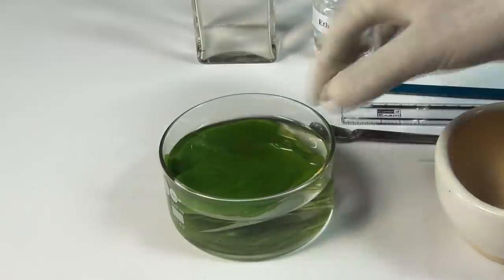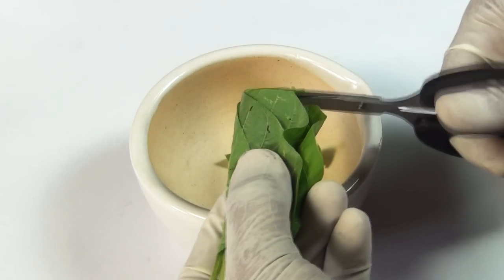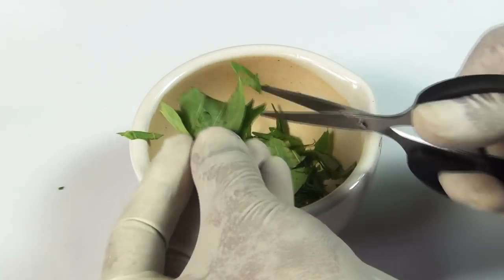Procedure: Take a few freshly plucked green spinach leaves. Using scissors, cut the spinach leaves into small pieces and let them fall into the mortar.